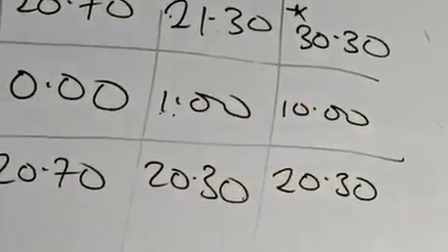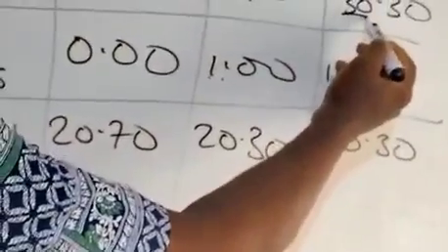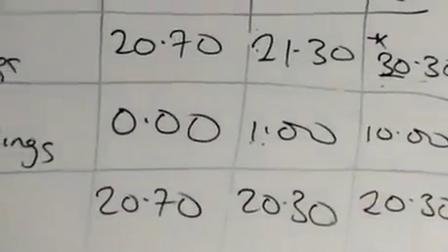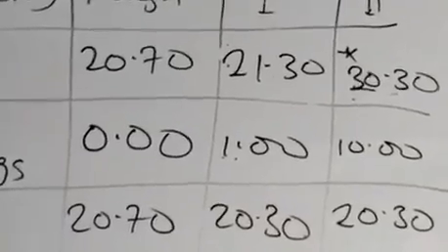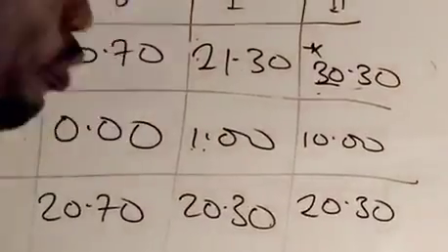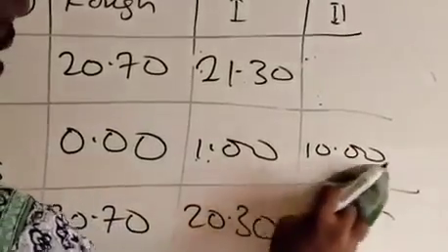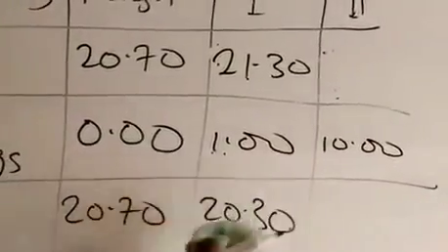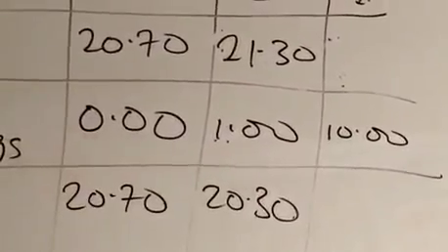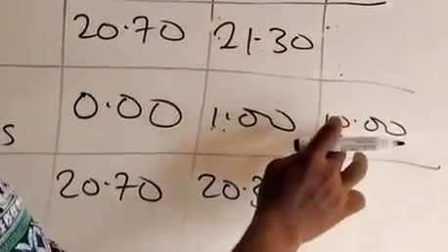So I run the acid until I reach 30, the nearest whole number to this value. When I reach 30, I'll now take it drop by drop between 30 and 30.5. It must definitely change. So I clean off the 30.3, because this one is estimated. But you don't write these things on your paper. This could be on your rough. Don't alter your table.